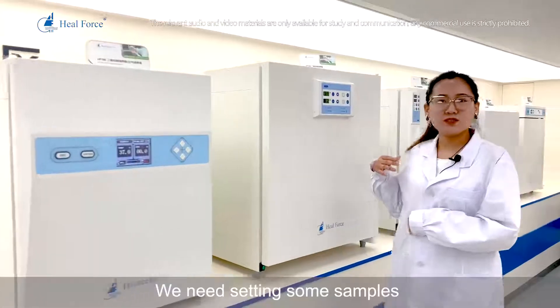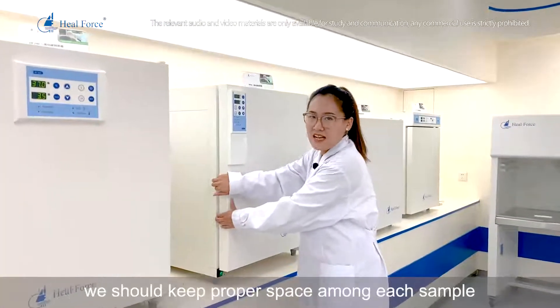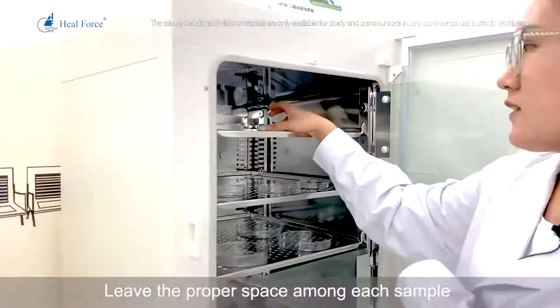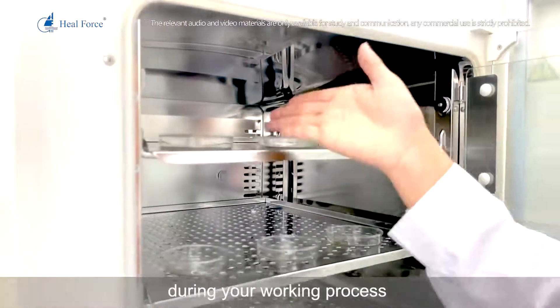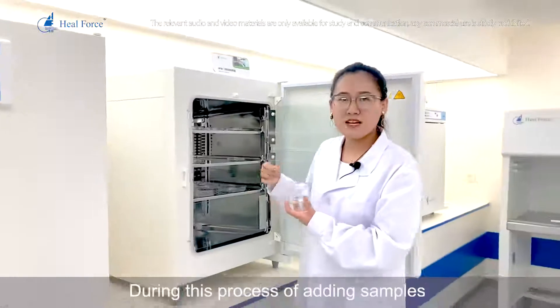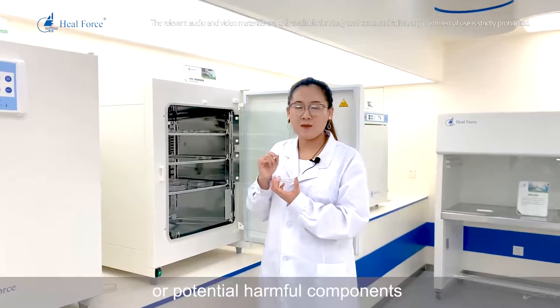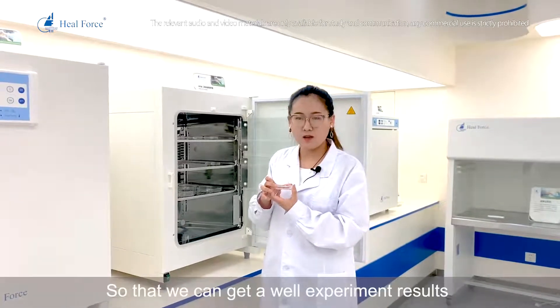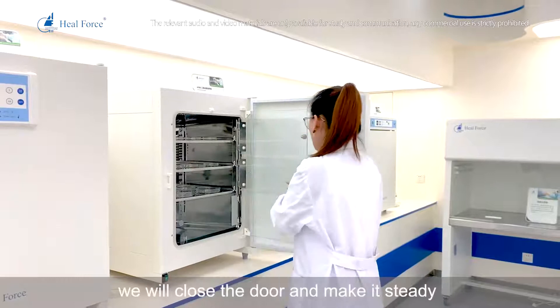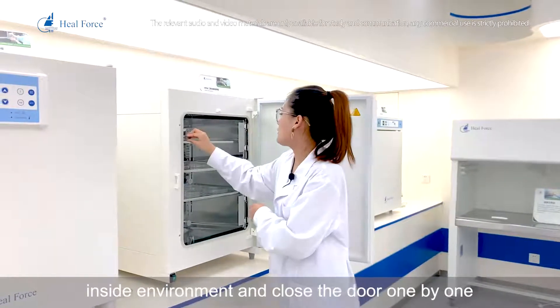Number 2: when placing samples, keep proper spacing among each sample — leave adequate space between samples during your working process. Number 3: during the sample-loading process, avoid introducing unknown or potentially harmful components, so that you can obtain good experimental results. After setting your samples, close the doors one by one to maintain a steady internal environment.